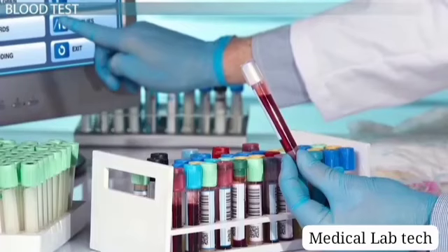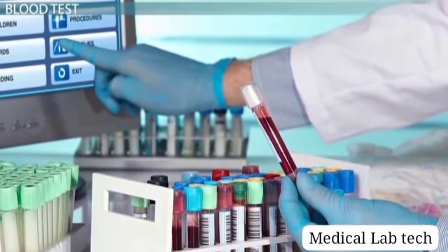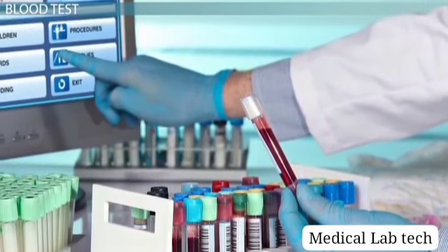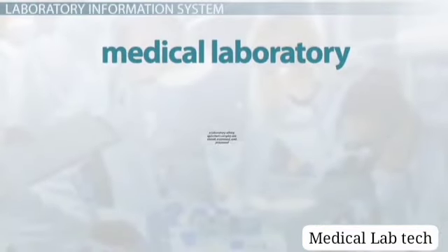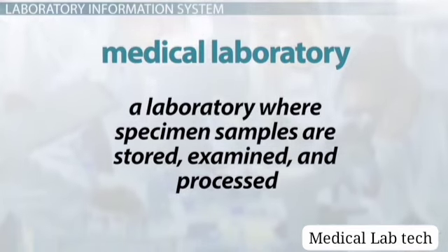The ability of the medical laboratory to keep track of Larry's information, blood sample, and test results, and send these test results on time to his doctor is possible in large part due to a laboratory information system. A medical laboratory is a laboratory where specimen samples are stored, examined, and processed.